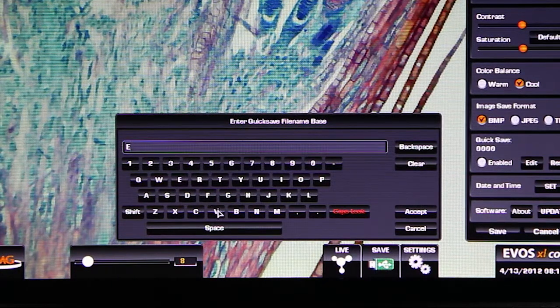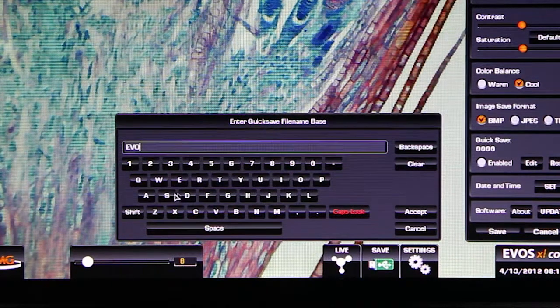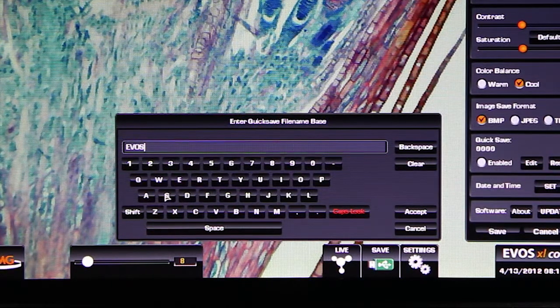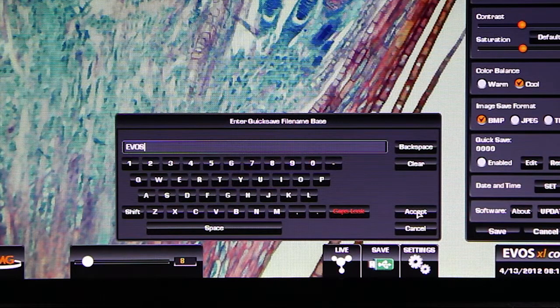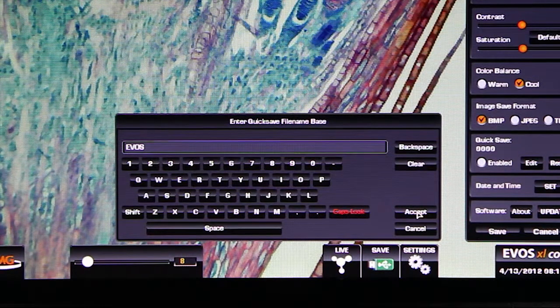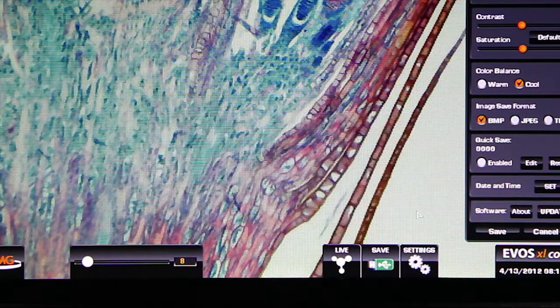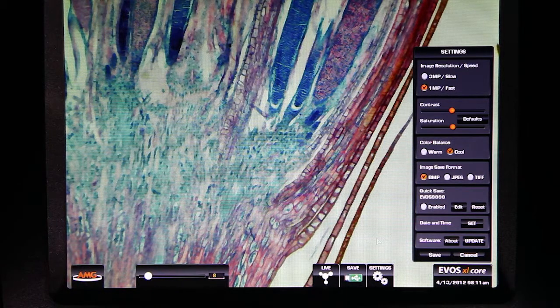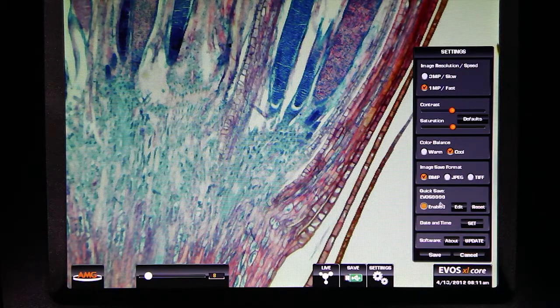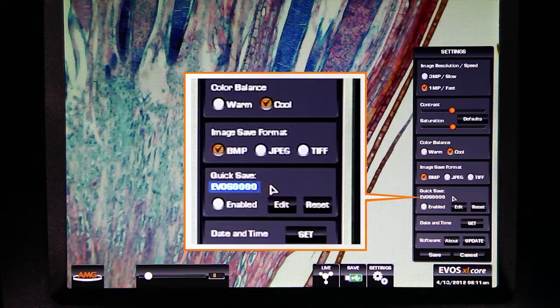After the virtual keyboard appears, simply enter your desired base file name. As you can see, I named the base file EVOS. Now when I use the quick save button, the base file naming convention will be used.